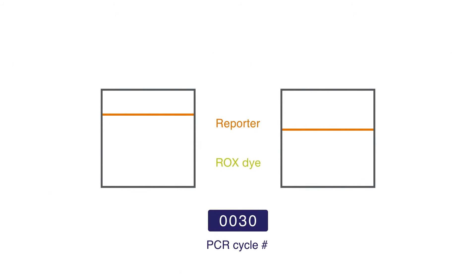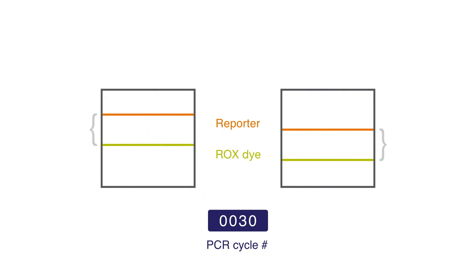Relatively speaking, these measurements are incorrect. Fortunately, we also have ROX dye in these same two wells, and like the reporter, it's also being measured. And look — it's actually shadowing the reporter. In other words, the system inconsistency is affecting ROX to the same degree that it's affecting the reporter. Importantly, the instrument will collect these paired measurements in every well at every cycle, and then divide every reporter measurement by its corresponding ROX measurement at the end of the run.